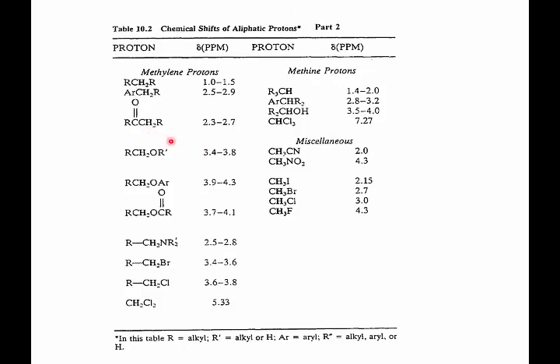The range we see is 2.3 to 2.7. So the structure is a little off, but again, we're dealing with estimates. The value in the middle of this range is 2.5. Now, to review, we have a value 2.7 for the methylene attached to an aromatic ring, the phenyl group, and then we have the value of the methylene that's attached to a carbonyl group.